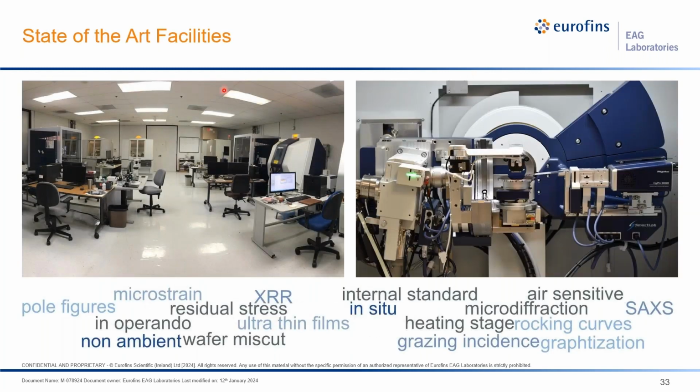So this is just a picture of our lab, and this is a close-up of one of our newer instruments that we're very proud of, and there are only 2 of these in the world as of the moment that I'm speaking. And we have instruments from Rigaku, Bruker, Panalytical. We have 9 X-ray diffractometers.